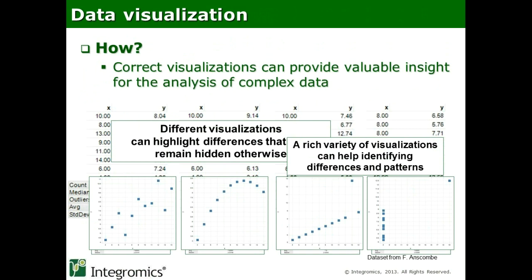But what I want to do is just make a point on the fact that by using visual exploration, you can easily detect by eye things that might be strange in the data, or large patterns that might be hidden if you only look at the standard parameters that are used frequently in the analysis.